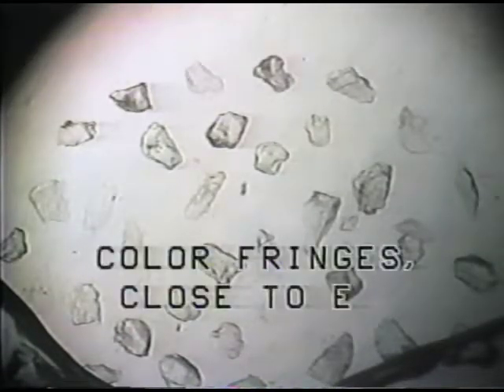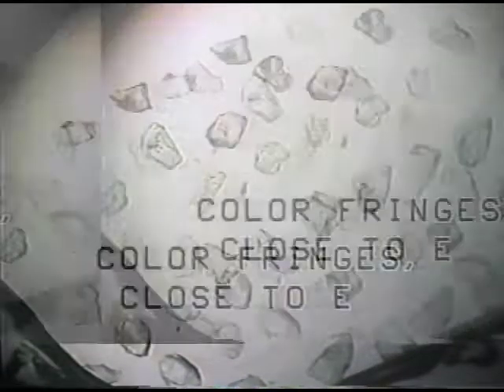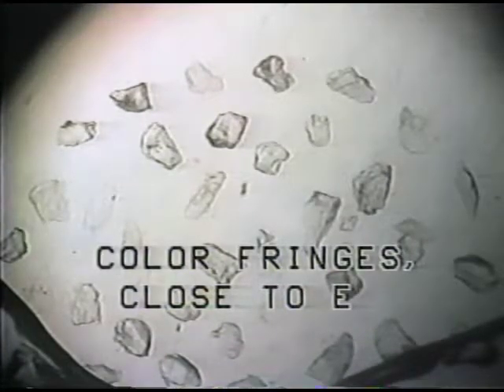Remember, what we're looking for here is a flash figure so that we can uniquely isolate the extraordinary ray. So we're looking for grains that have significant birefringence, that certainly show significant retardation, but the best way to find them in this kind of mount is to look for the ones that have a low relief.